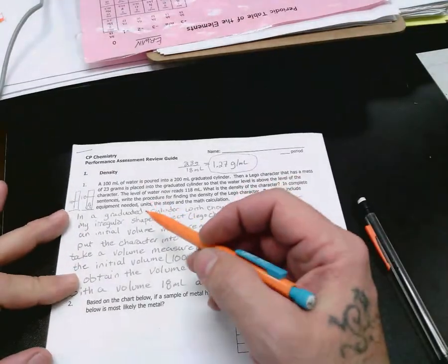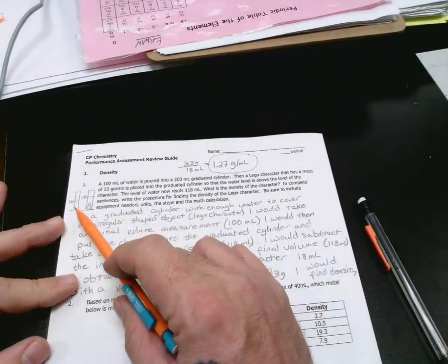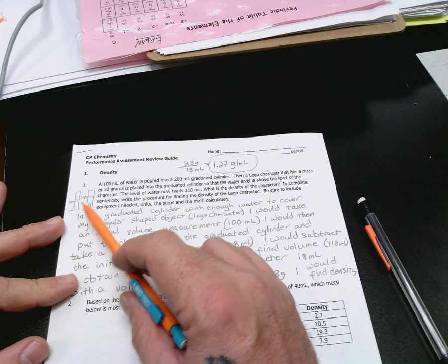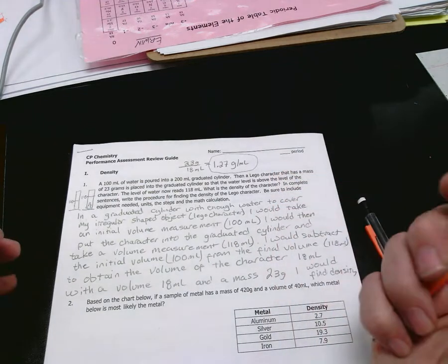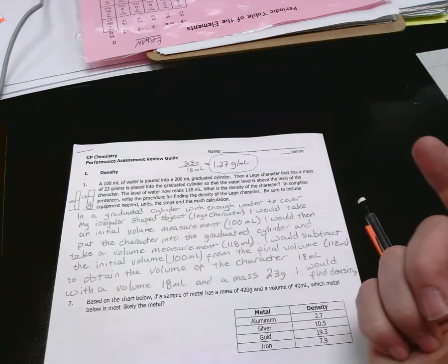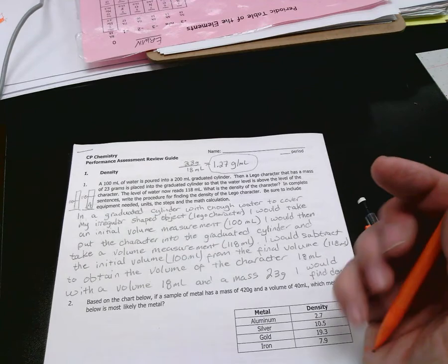Basically, you take a graduated cylinder with enough water to cover the object. You drop the object in. That way you have an initial volume and a final volume. You subtract the initial volume from the final volume, and that gives you the volume of the actual character.